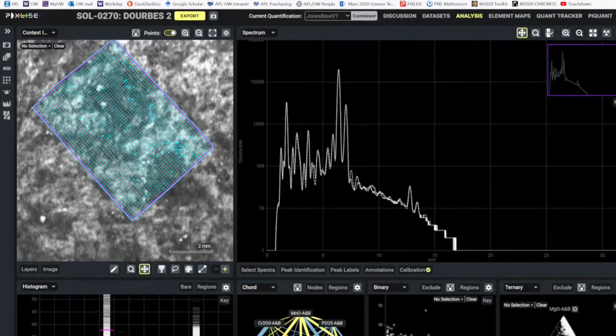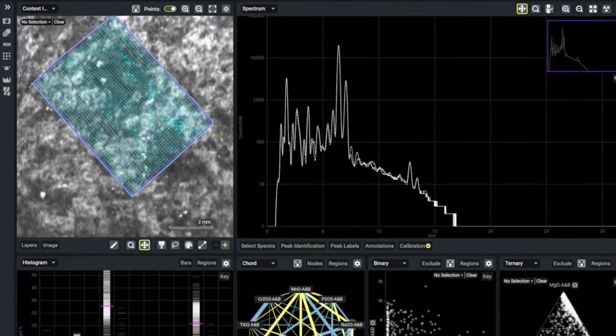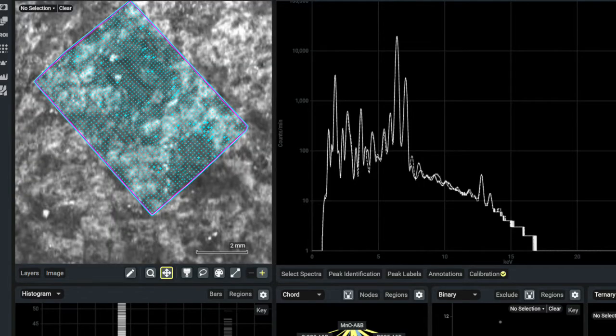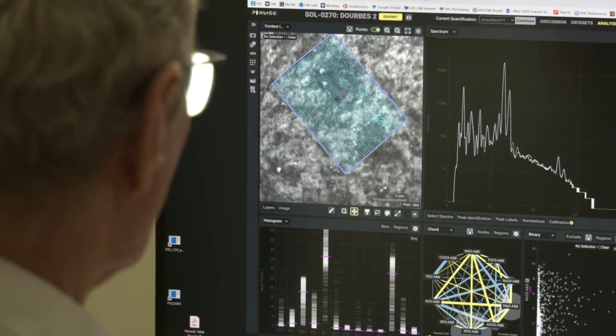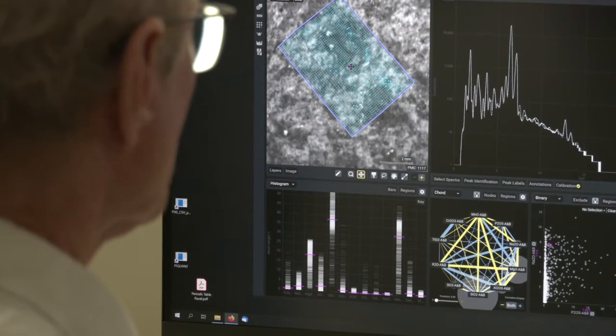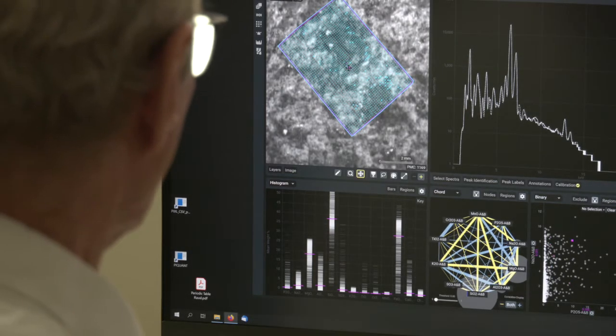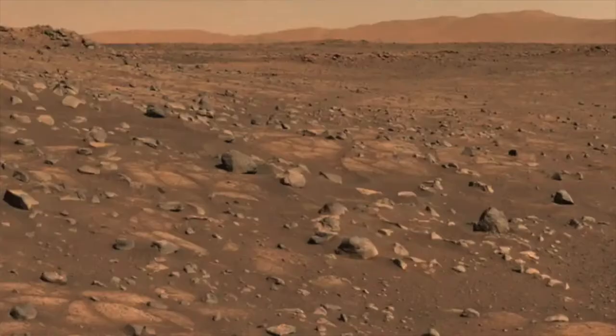For the results in this paper, the main thing is I wrote a set of software that takes the X-ray spectra and converts it to elemental abundances, that is, which elements are there, iron, silicon, and how much of each one is there. And you can see each of the different points that we've measured in this raster scan is over here on the left, overlaid on a visible light image, so that we can tell where they all are on the image that one would see with one's eyes if one could stand on Mars.